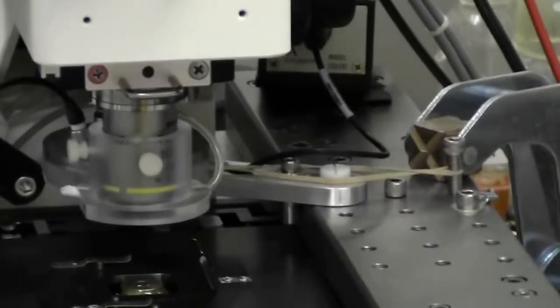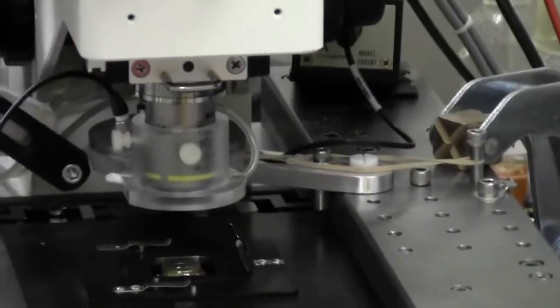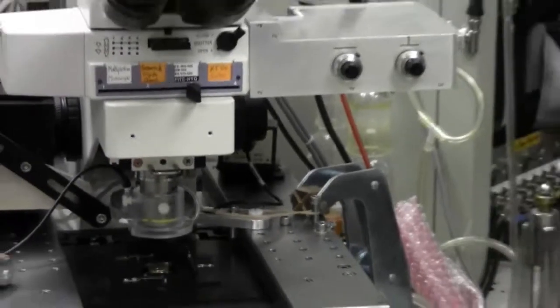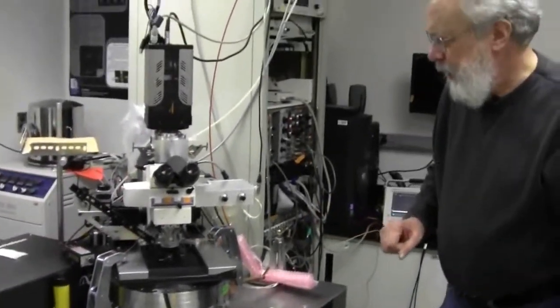The second objective also has a detector mounted on it. It's a transparent detector so we can count particles arriving while we're observing the cells during the irradiation.